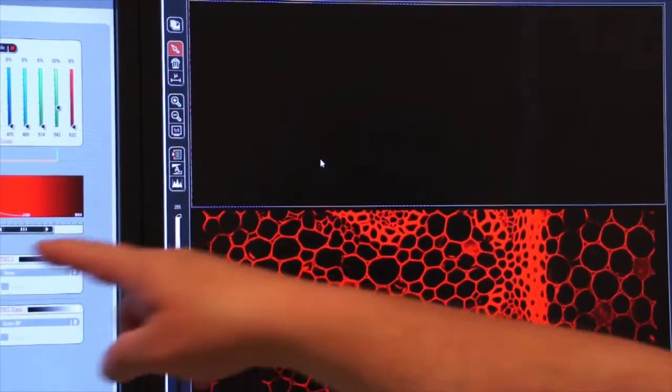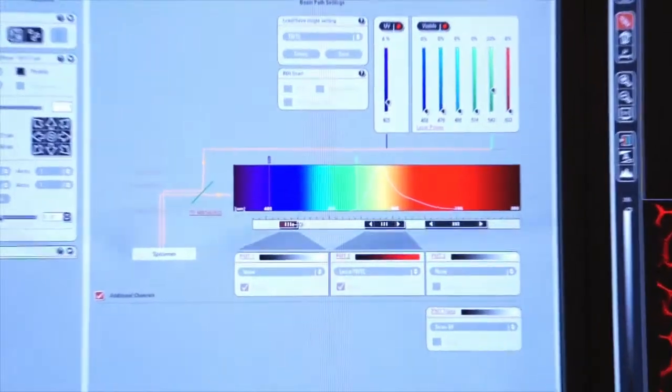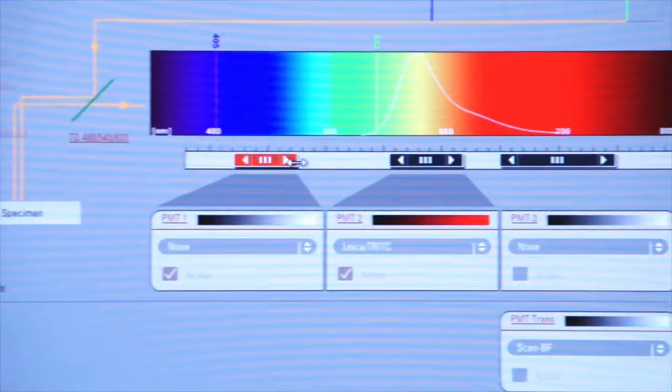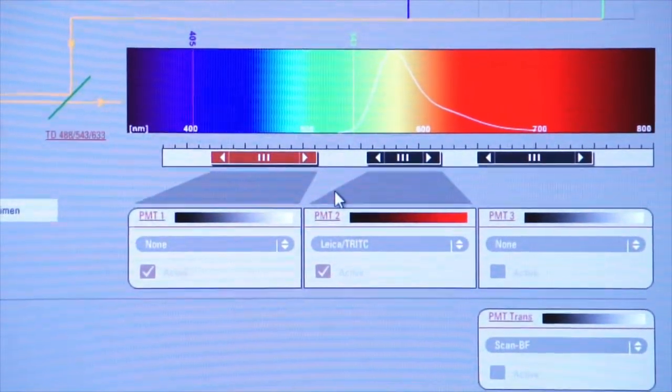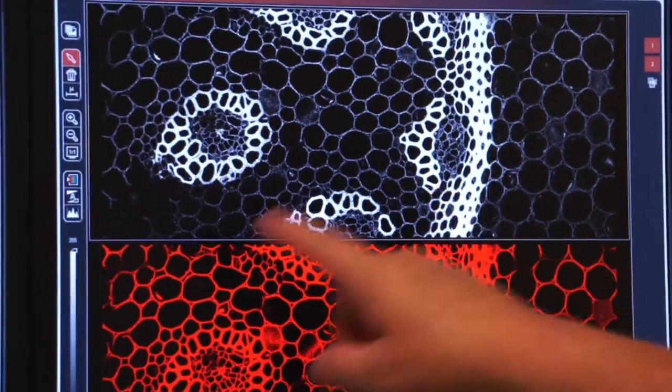Let's concentrate on the left monitor for a second. I'm going to grab the PMT and stretch it out, and now you can see how much light enters this window from that region of the spectrum that we're collecting from PMT number one.